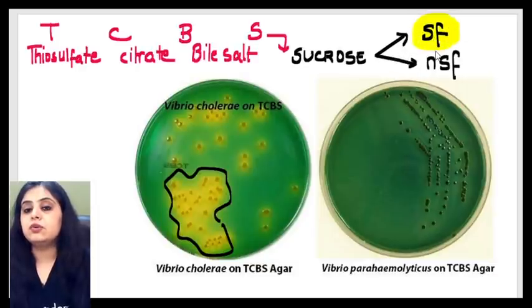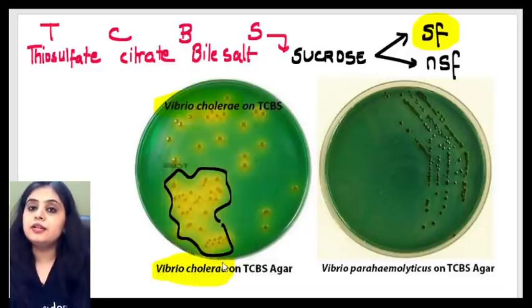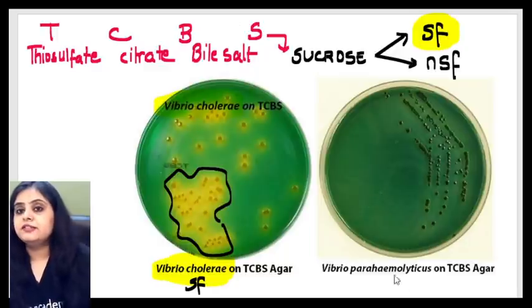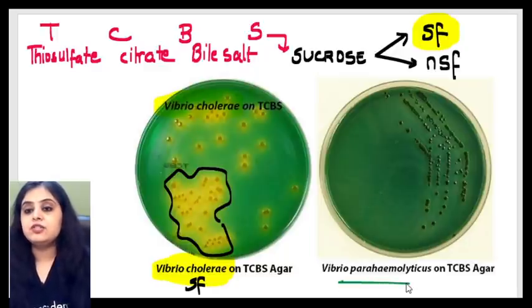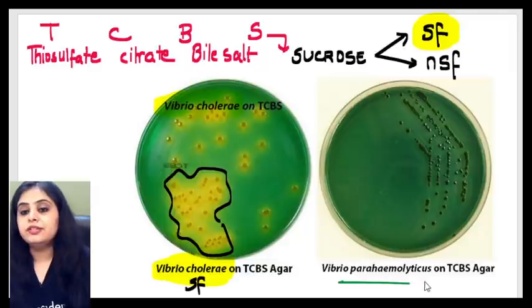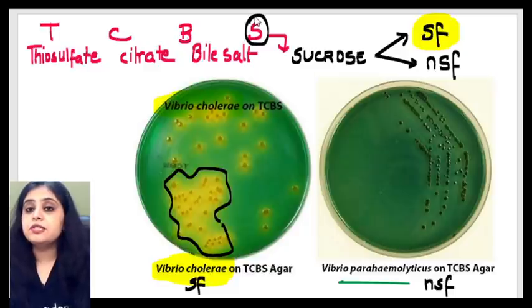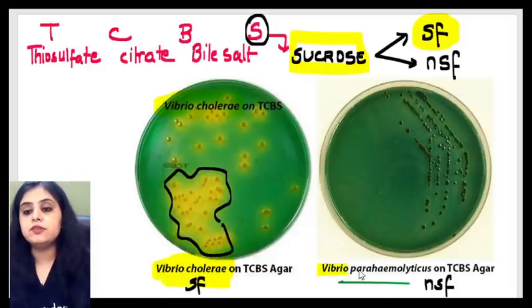Sucrose fermentation gives a yellow color. So we saw that Vibrio cholera is a sucrose fermenter, it gives a yellow color. Whereas Vibrio parahemolyticus, see it's not shown any color change, it's green as it is. So this is a non-sucrose fermenter. So can I say the TCBS medium is a very important differential medium. It differentiates between the sucrose fermenting ability, thereby differentiating between Cholera versus Vibrio parahemolyticus.